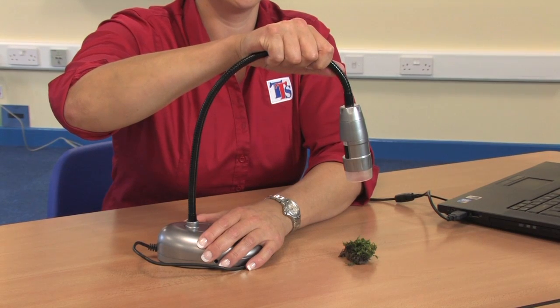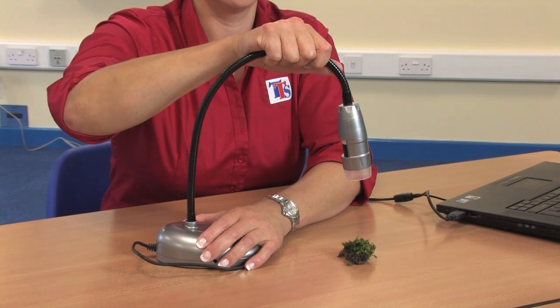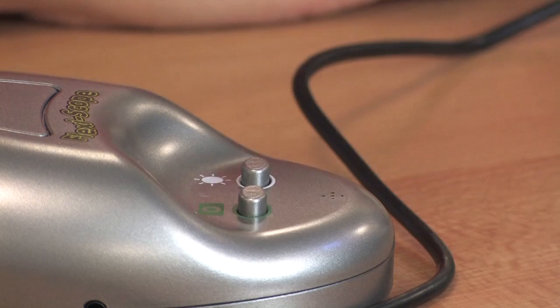It has a flexible gooseneck that can be placed in just the right position to get up close to objects. The bright LEDs ensure that even with low lighting levels an excellent image can be obtained.